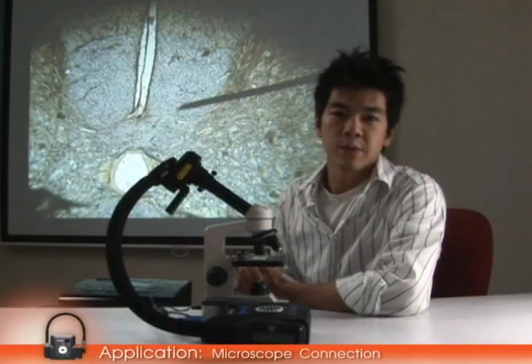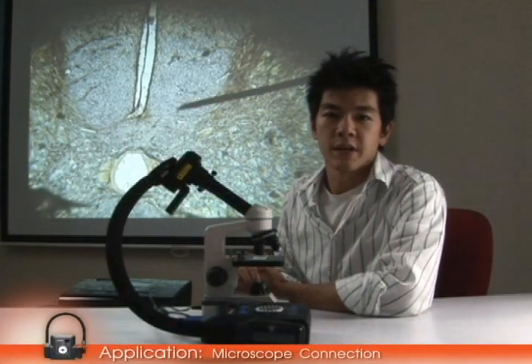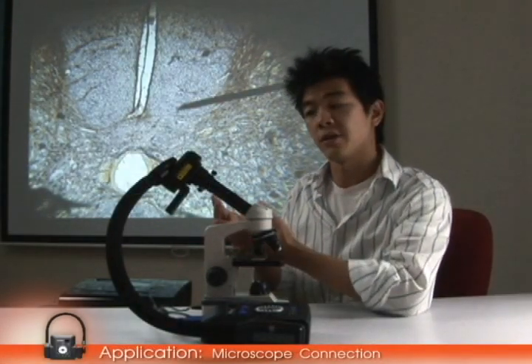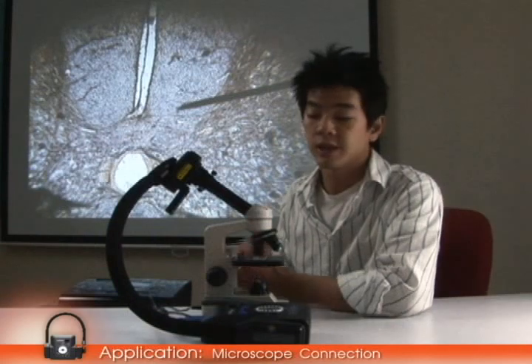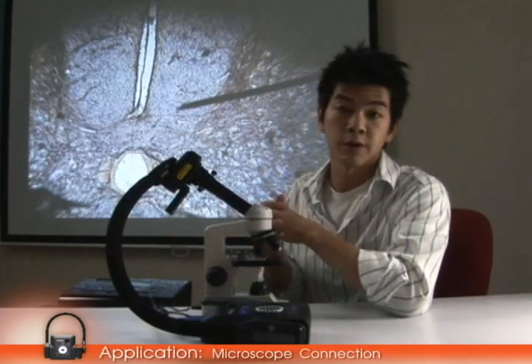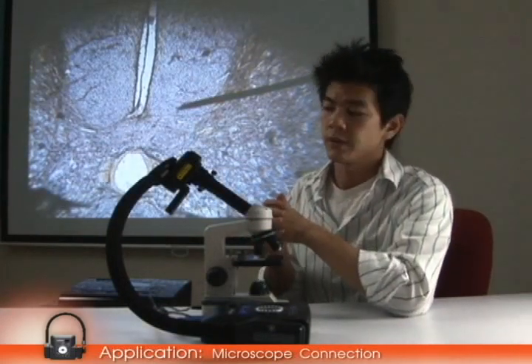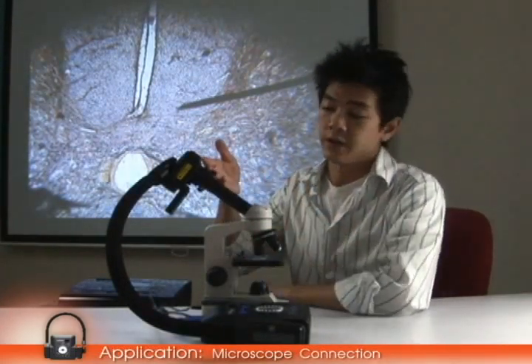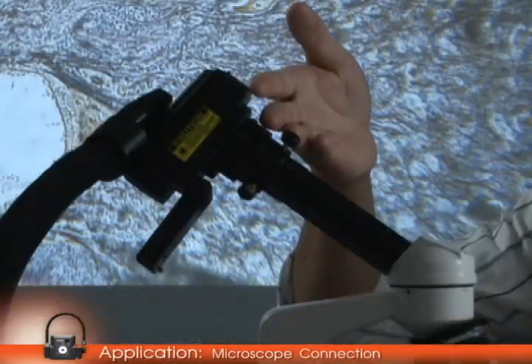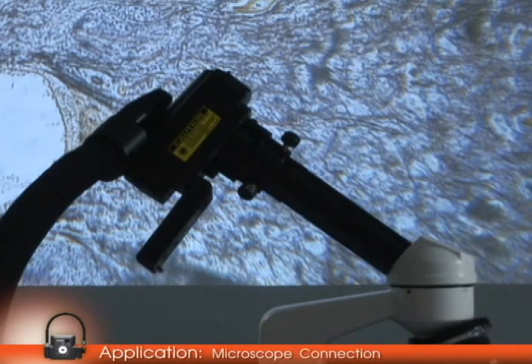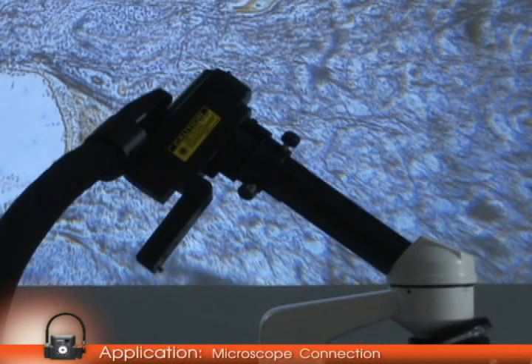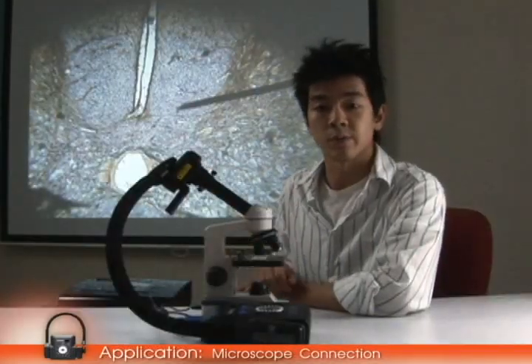Hey everyone, my name is Ed with EverMedia and what I'd like to do now is show you how our visualizers can be easily connected to microscopes. If you take a look right here, you can see that there's a microscope adapter and obviously a microscope, and these are connected through the microscope lens.